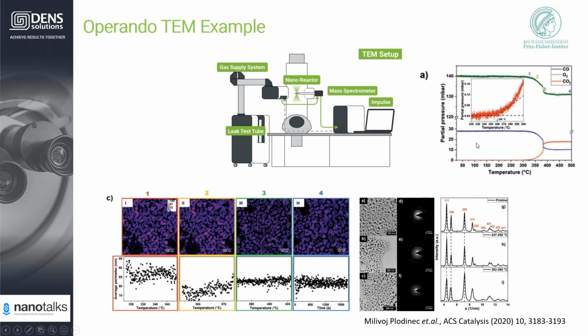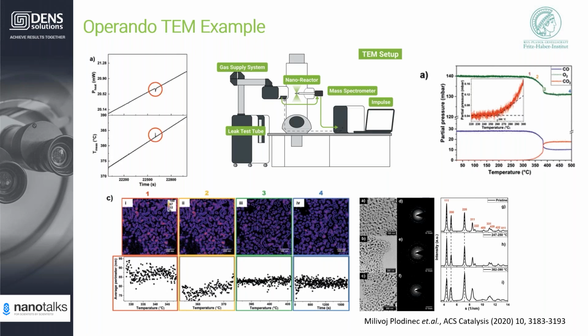And at around 380 degrees Celsius, there's a very sharp increase in the reaction products. This is also called an ignition reaction in the process. If we look at the calorimetry data, at around 380 degrees Celsius people find a very sharp increase in the temperature and also a very sharp decrease in the heating power.